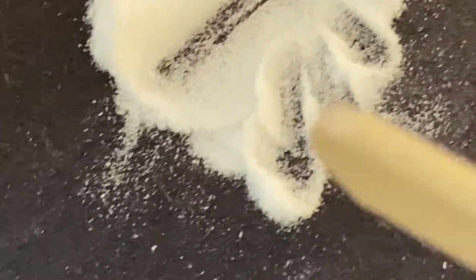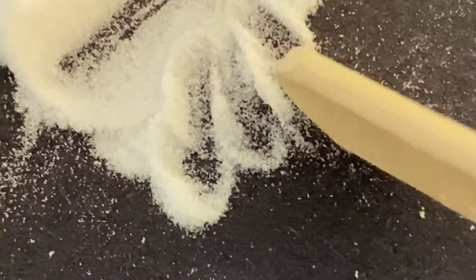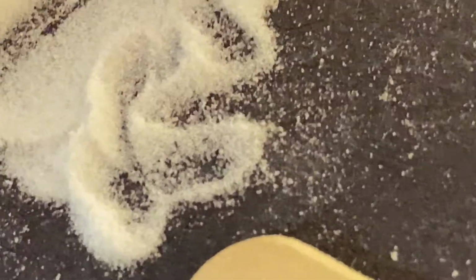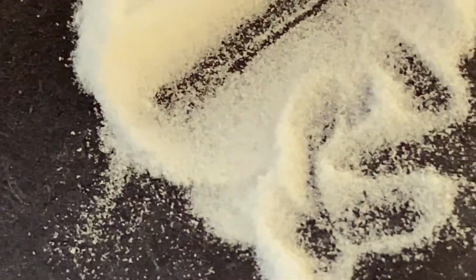And remember, the way we tell if it's a crystal or a powder, crystals have flat faces, while powders are more round. So what are the shape of these pieces? Mr. Marambo's closing up a bit. Are they circular or rectangular? Pause it for a clearer view.